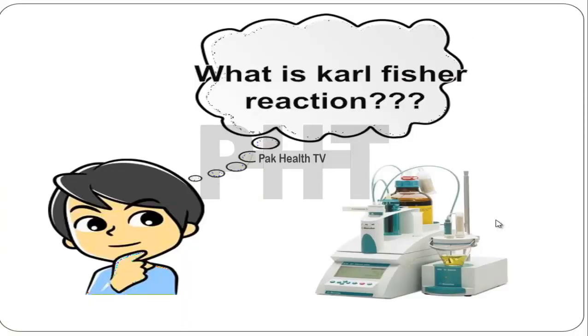What is Karl Fischer reaction? Today I will talk in detail about what is Karl Fischer and what is Karl Fischer reaction.